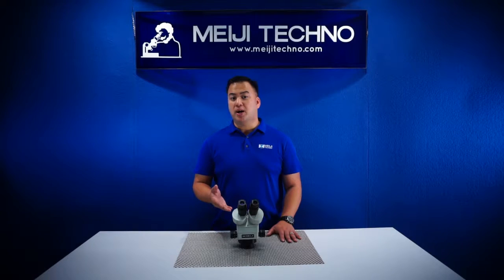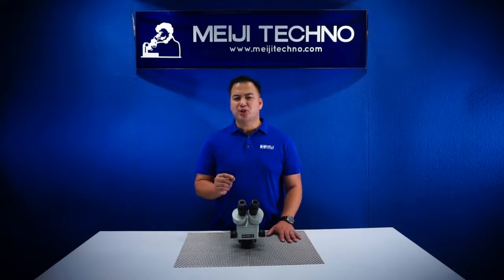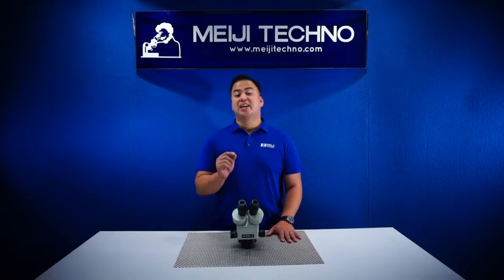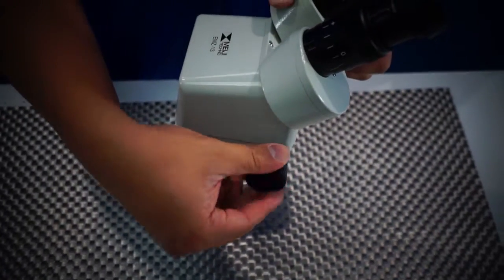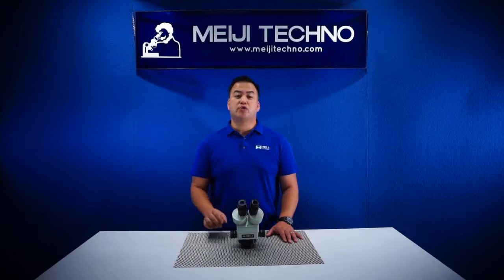The EMZ-13 body offers crisp, high-resolution precision optics giving an excellent erect, unreversed stereoscopic image. The EMZ-13's zoom range is from 1x to 7x with a ratio of 7 to 1.